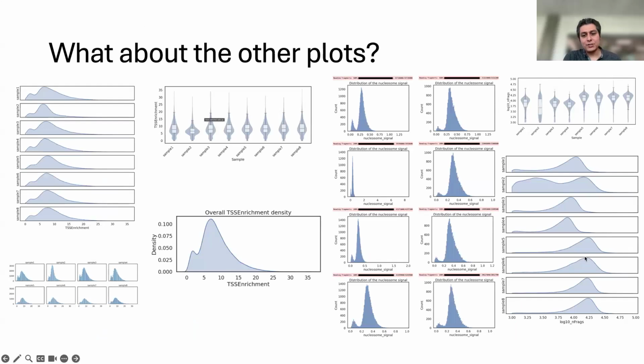If we were interested in doing this in ArchR or snATAC or R-based pipelines, any of these plots can be generated with matplotlib or Seaborn, or any number of Python plotting packages. Essentially, we can make our ridge plots and violin plots, and then base our quality control thresholds on these if you're more used to working in this framework.